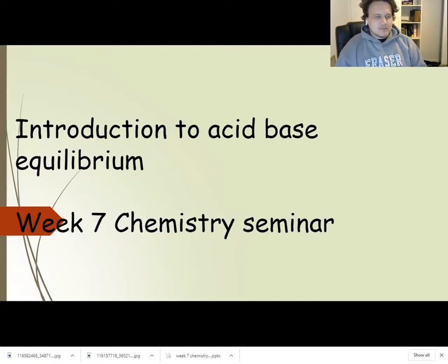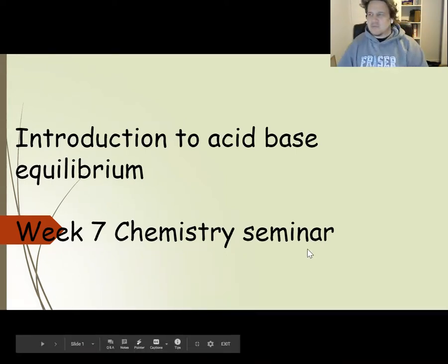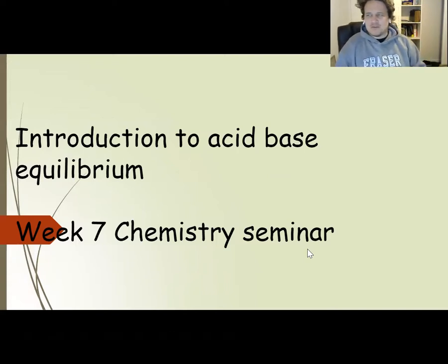This week is going to be fairly light compared to the last two, and probably a bit shorter. But what I'm going to do for the videos is actually experimentally show what happens when you mix acids and bases, and the practical applications of this, and why acids are dangerous and why bases are dangerous.